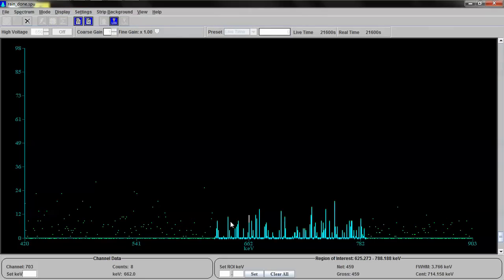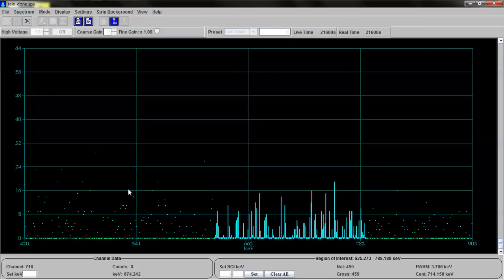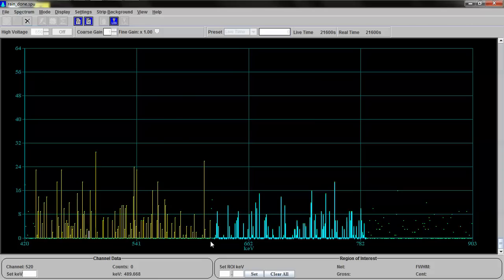So here it is. This is where Cs137 should be, and as you can see, there's not a lot going on here. It's not particularly high. It's not particularly higher than anything else. Let's put a grid in. See what I mean? There are other random things here that are equally higher, if not more so. Look at that. In fact, that's actually an unimportant looking region where the Cs137 should be.